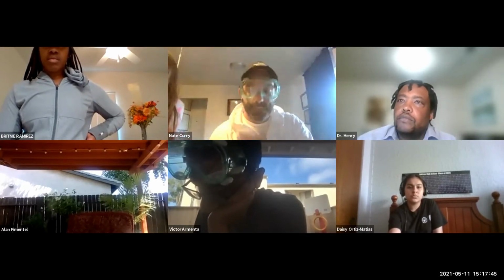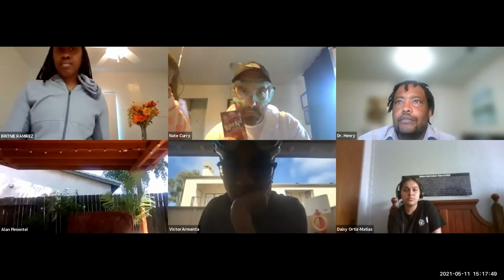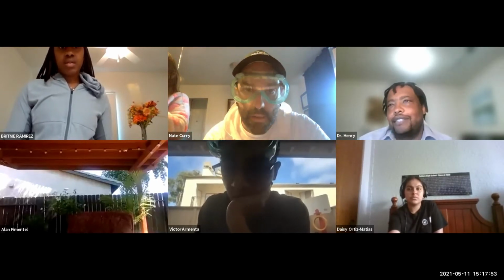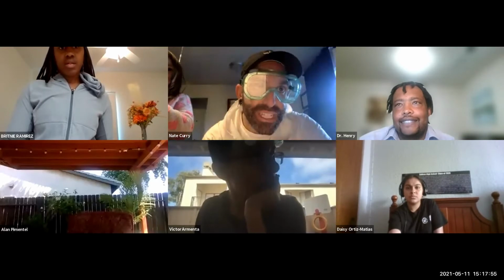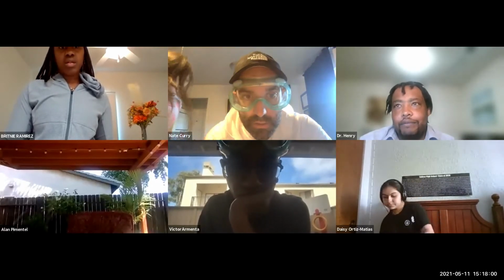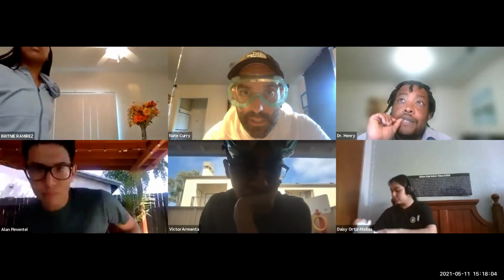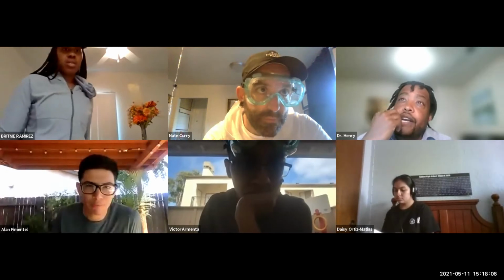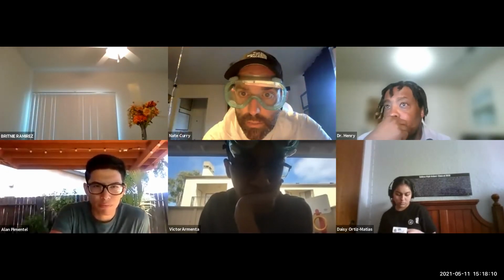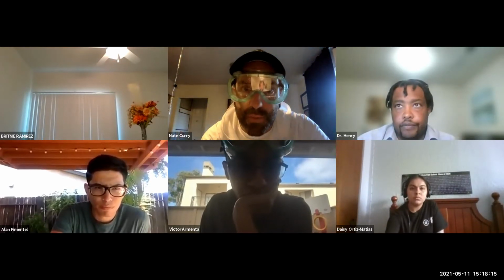I think we're actually going to do stuff in the lab that's going to test that. So what percentage do you think it's going to be? Well, citric acid is listed first, so I'm gonna guess like 50% or more. That's just a guess. The tartness, I don't know. It seems like a lot though, 50% citric acid. I'm gonna go 20%.